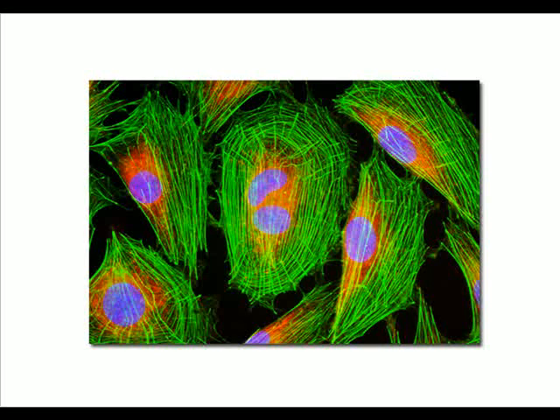This picture shows how you could use immunofluorescence to stain organelles in the same cell with many different colors. This is useful in studying localization of organelles.